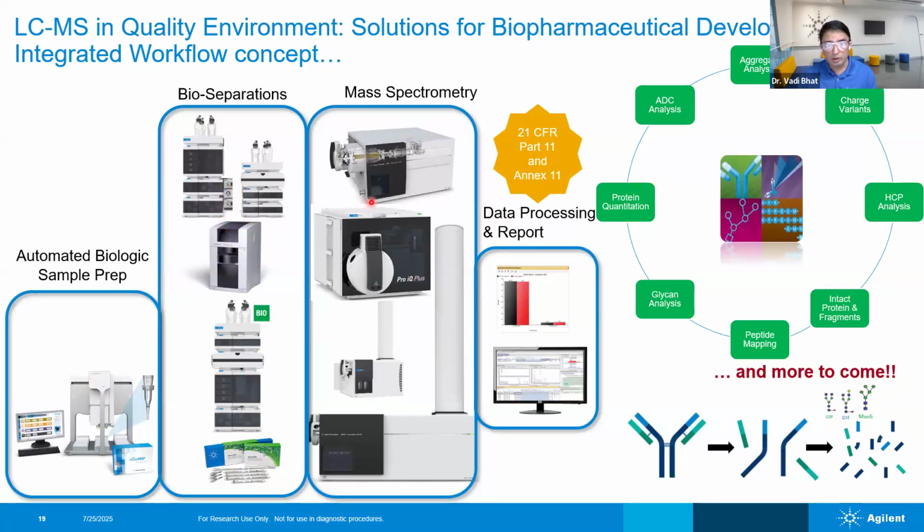Then you detect either with simple UV, fluorescent, or light scattering detectors, or with mass spectrometry, from simple single quad mass specs to high-end mass specs. Sample preparation becomes critical, and combining all these things, including the software for data analysis and reporting, the step-by-step protocols and SOPs, can be called a workflow solution.